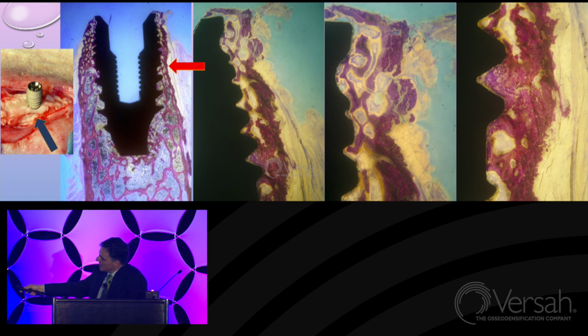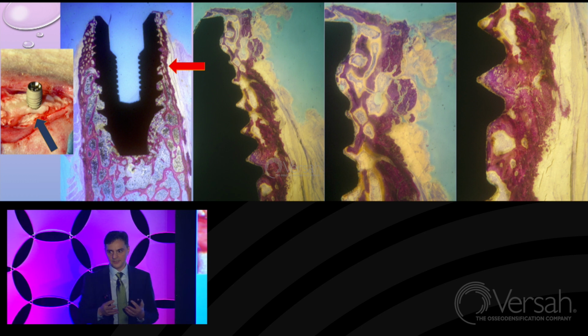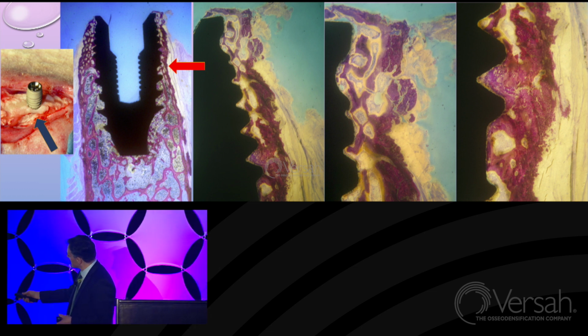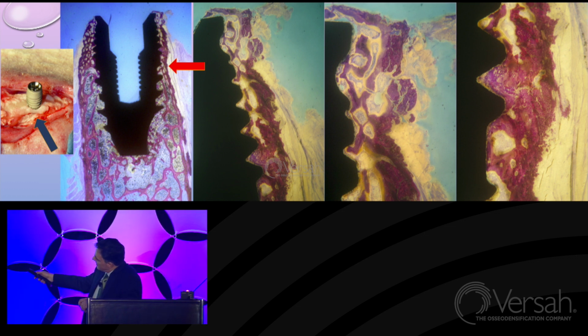And if you see here, at higher magnification, you see something that I never saw in almost 30 years of my histologic experience, which is a granular bone. We saw also in the histology from Professor Coelho, the lamellar bone changes its morphology and becomes granular. I think I have some higher magnification. Yes. You can see all these granules.